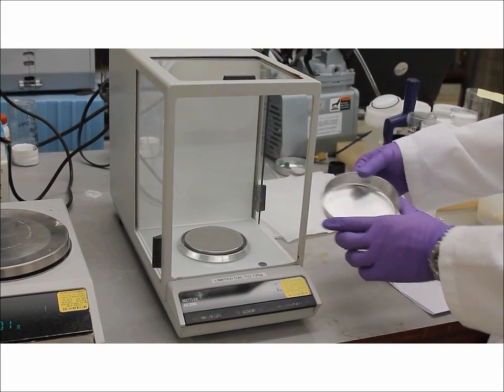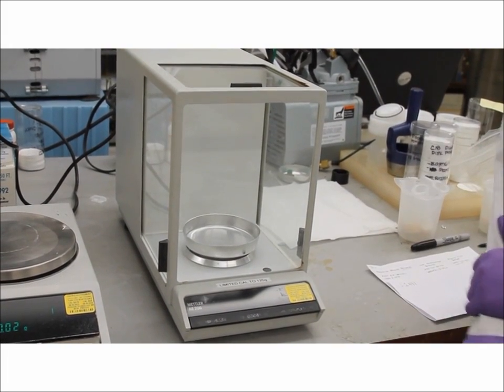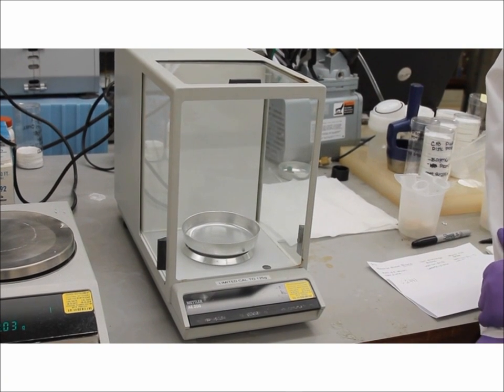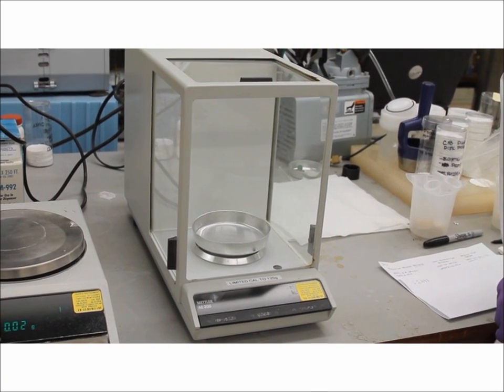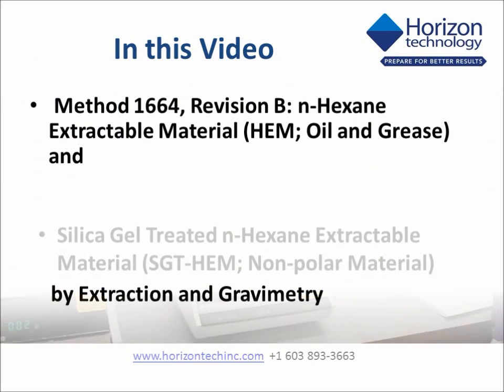This is the end product of concentrating down your SGTHEM portion. As you can see, there's a glossy, oily substance. Now you want to weigh your pan and subtract the initial empty pan value from the full pan value to obtain your gravimetric silica gel treated N-hexane extractable material result.